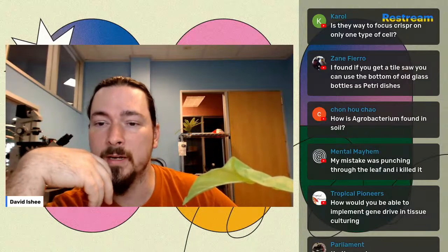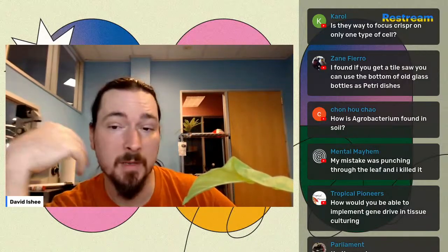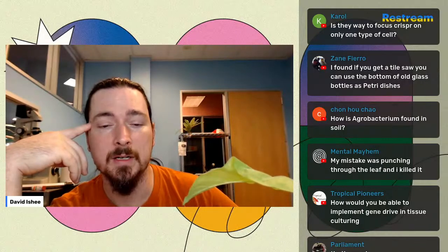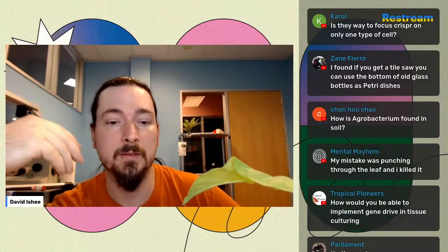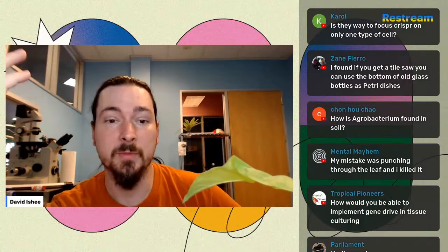I found if you get a tile saw, you can use the bottom of old glass bottles as petri dishes. Yeah, I started out with glass petri dishes. I used glass petri dishes for years and years. The nice thing about them is they're reusable. You don't produce so much plastic waste. You just wash them, autoclave them, and use them again.